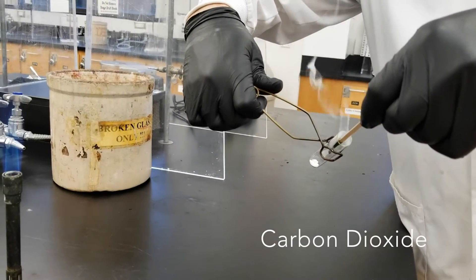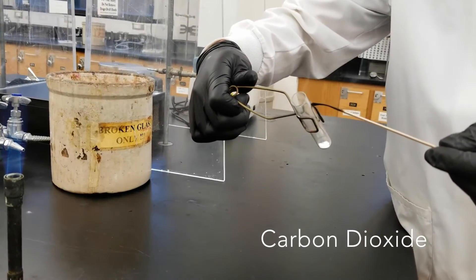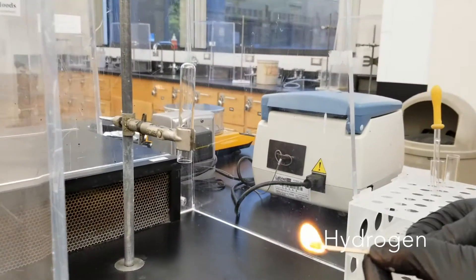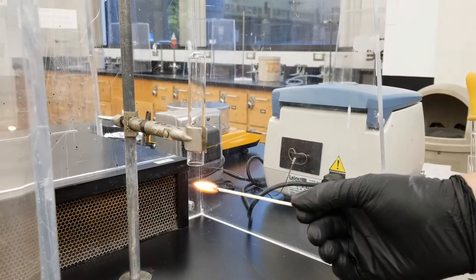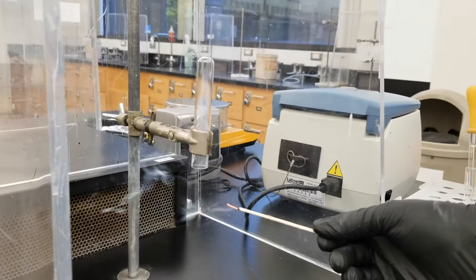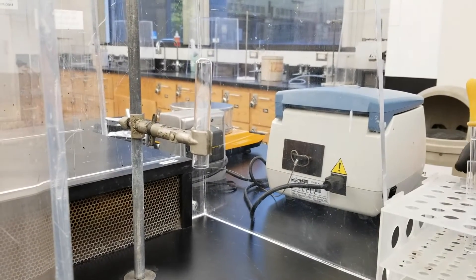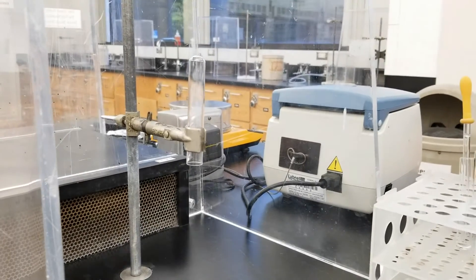A burning splint's flame will go out when exposed to carbon dioxide because it does not support combustion. A burning splint will cause a small explosion when exposed to hydrogen because hydrogen burns rapidly. Don't worry, in this lab it's a very small explosion and it will make a popping sound.